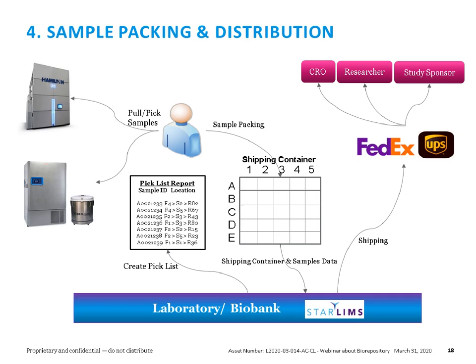And once they have the samples, the next thing could be to put them in some kind of container. So in this example, I have a shipping container. This is a 5x5 box, for instance. You can define different layouts for your shipping containers, and then say, okay, this is where I'm going to put my samples. And part of your pick list could also be to define, okay, I need to put these samples in these specific positions, because sometimes a researcher could be asking the laboratory, I need the samples in this type of container in these specific positions. So it could go as granular as that.